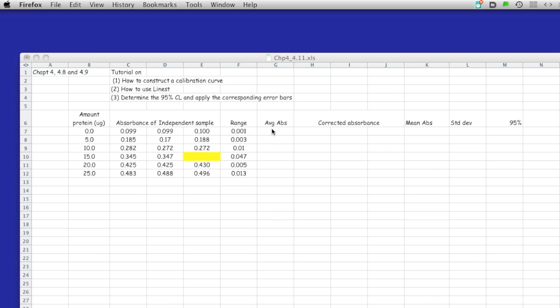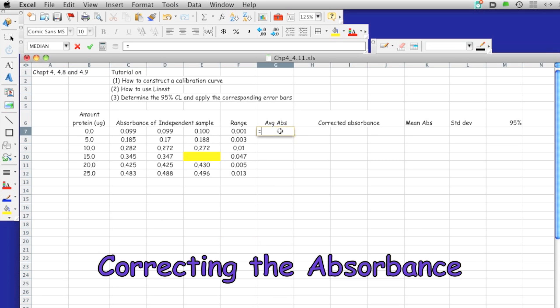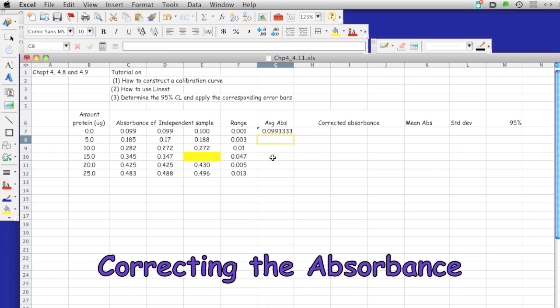In this particular case, we're going to take these independent readings, take the average of it, and then use this average to correct for all the other absorbance readings. In order to have Excel choose this reading, we're going to put a dollar sign so that the cell doesn't move when we apply the automated calculation.